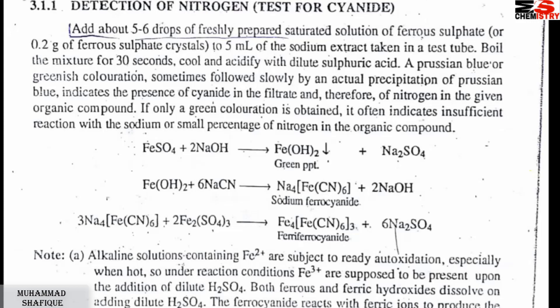That is the sodium extract — it is alkaline. We will use dilute sulfuric acid to acidify it. What will happen? Prussian blue color or a greenish color will appear.